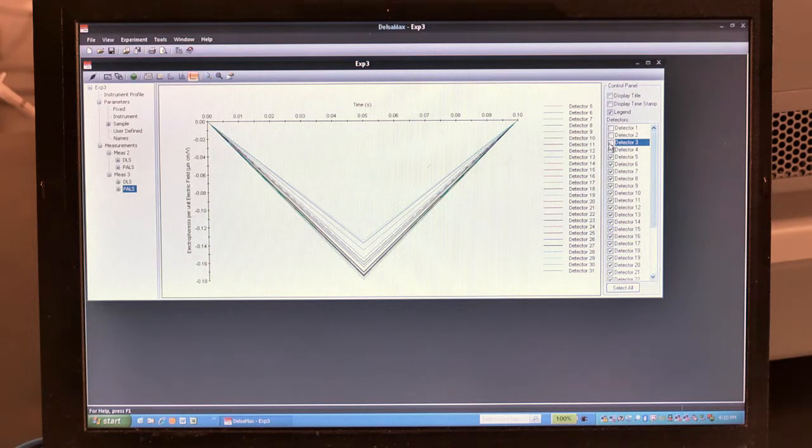The detectors with larger angles, detectors 5 through 31, that have angles ranging from 5 degrees up to 14 degrees, pick up the light scattered by the smaller micelles. So these are the ones that are accurately measuring the mobility of the micelles, whereas the first 4 detectors were measuring the mobility of the larger aggregate molecules that we're not as concerned about. The software allows us to select and deselect data points that are bad due to dust events or aggregation. So in this case, we deselect the data points that don't correspond to what we are aiming to measure.